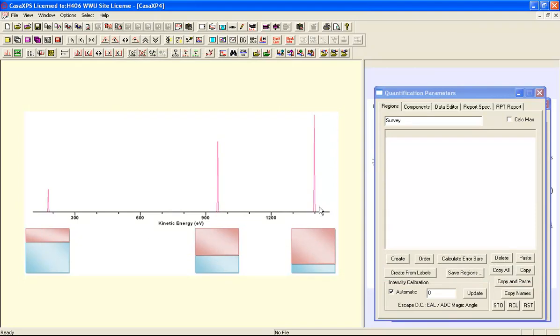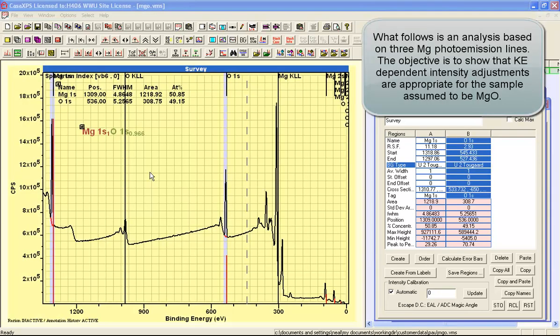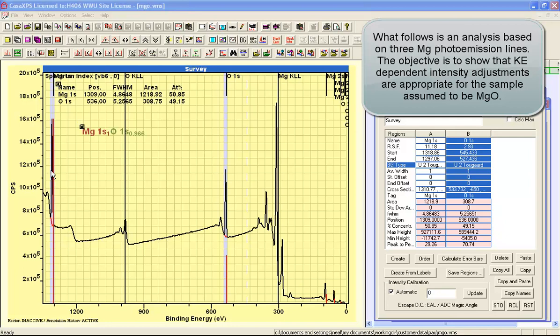Hence, without such a correction, the quantification makes little sense. Both the transmission and the escape depth represent adjustments that are based on the kinetic energy of the photoemission lines. And since magnesium comes with a set of three photoemission peaks over a wide range of kinetic energy, then one of the tests that we ought to do is confirm that our corrections are giving us reasonable answers for these magnesium peaks.